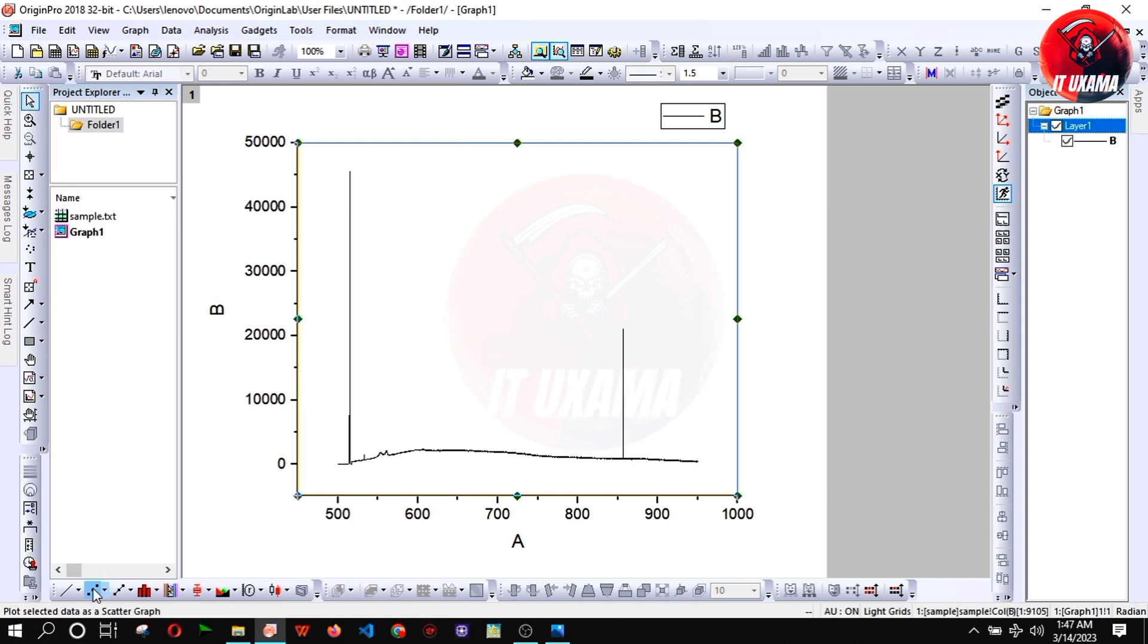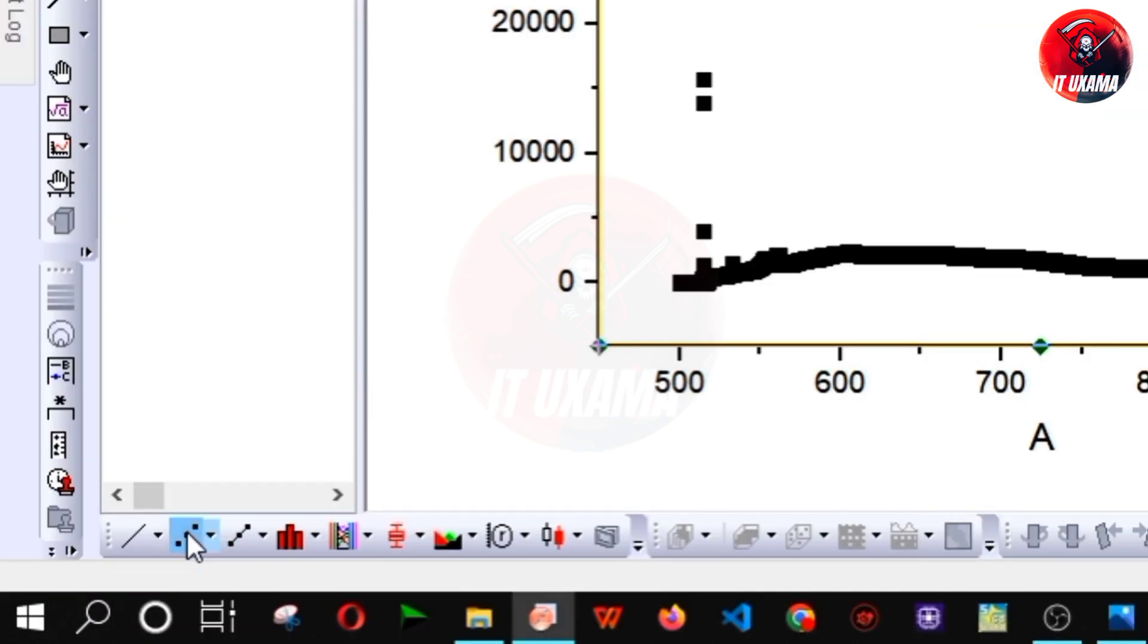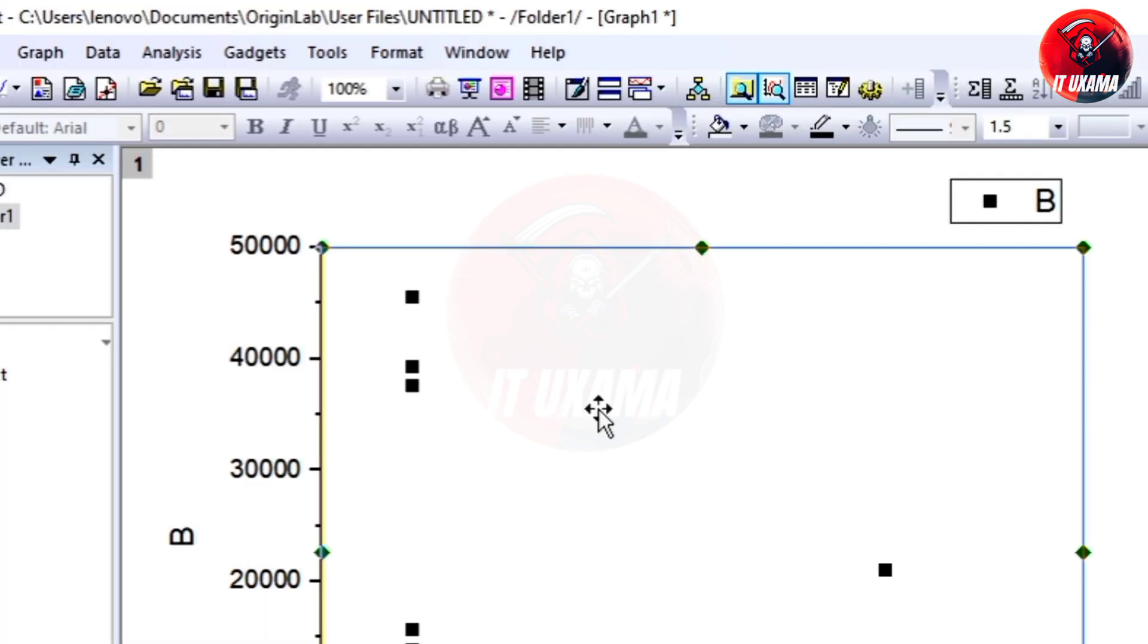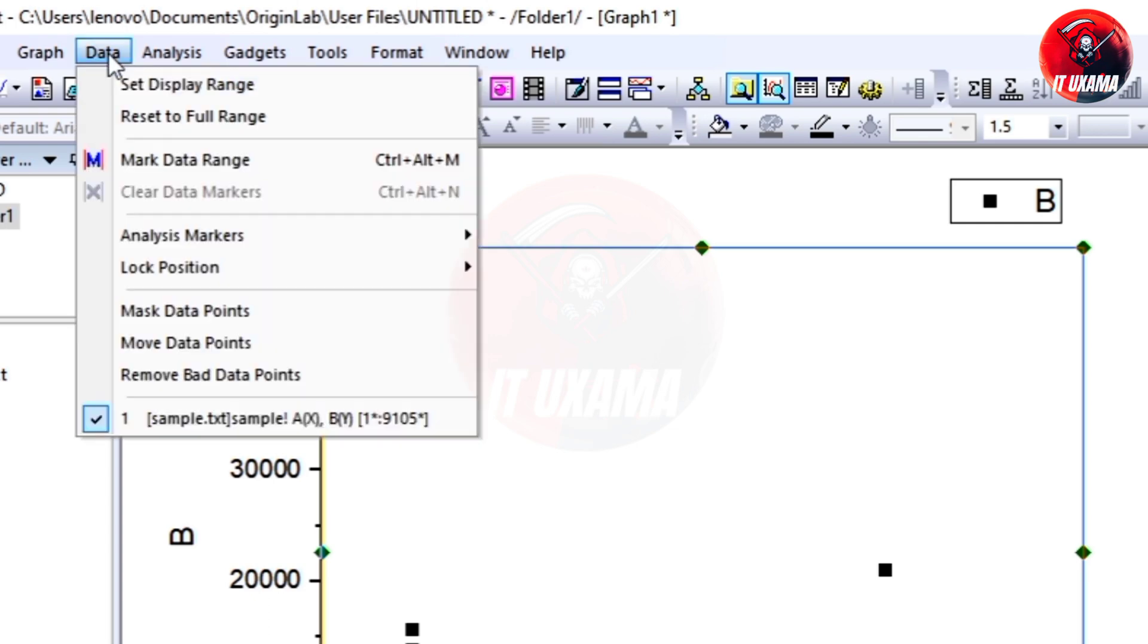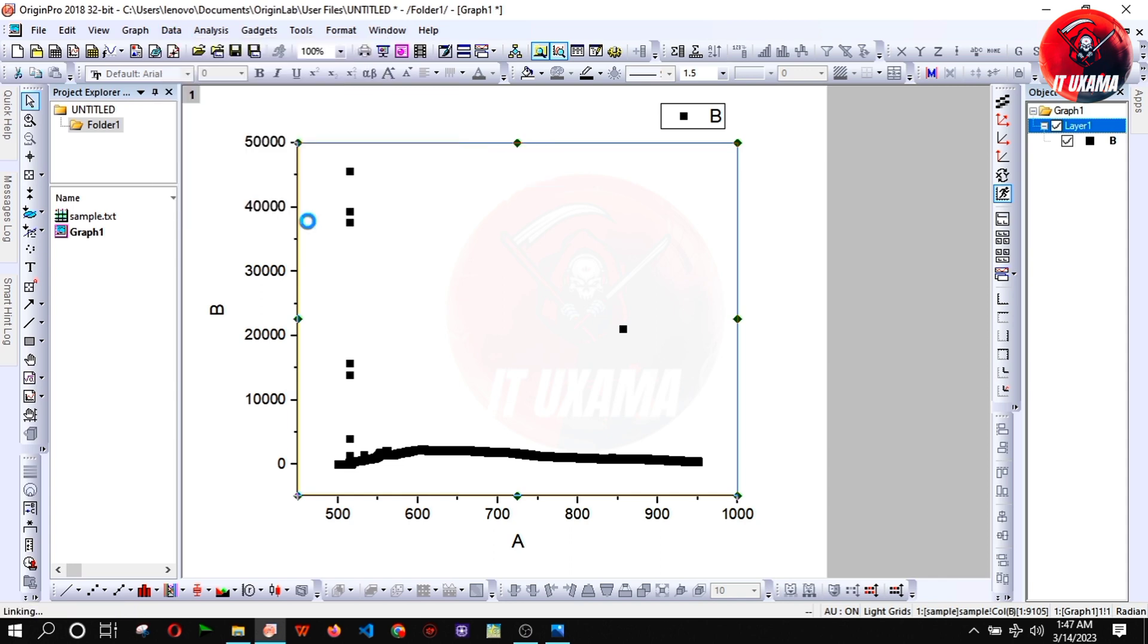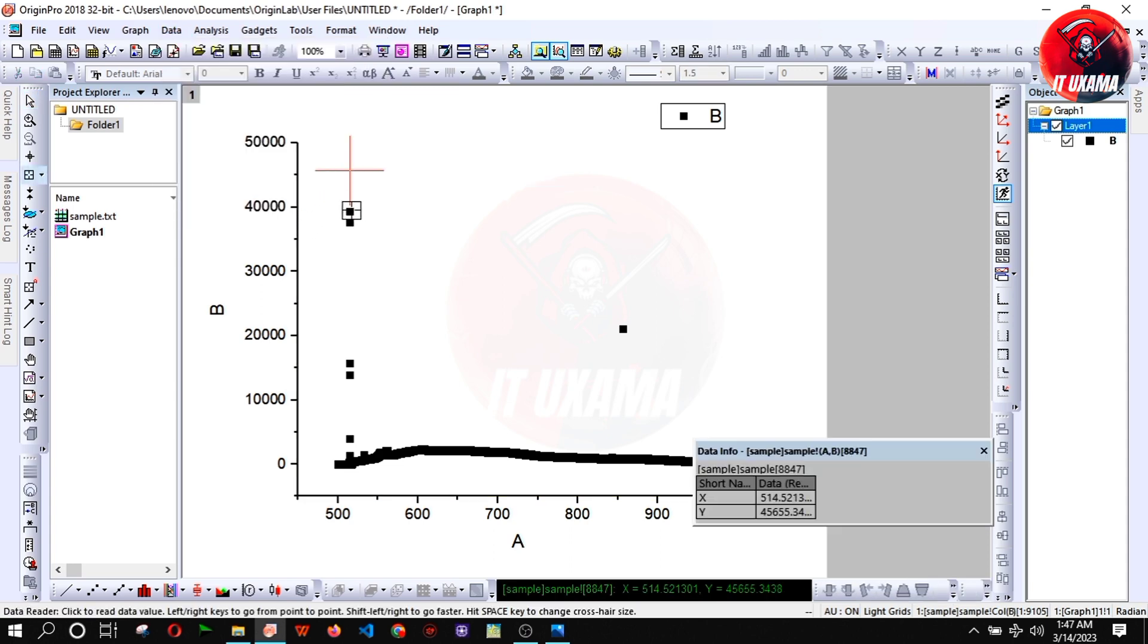Now just select the curve and go to point plot next to line plot. Here you can clearly see few points disrupting our whole data. In order to remove them go to data option on toolbar and then select remove bad data points. Now you can remove these error data by double right click.